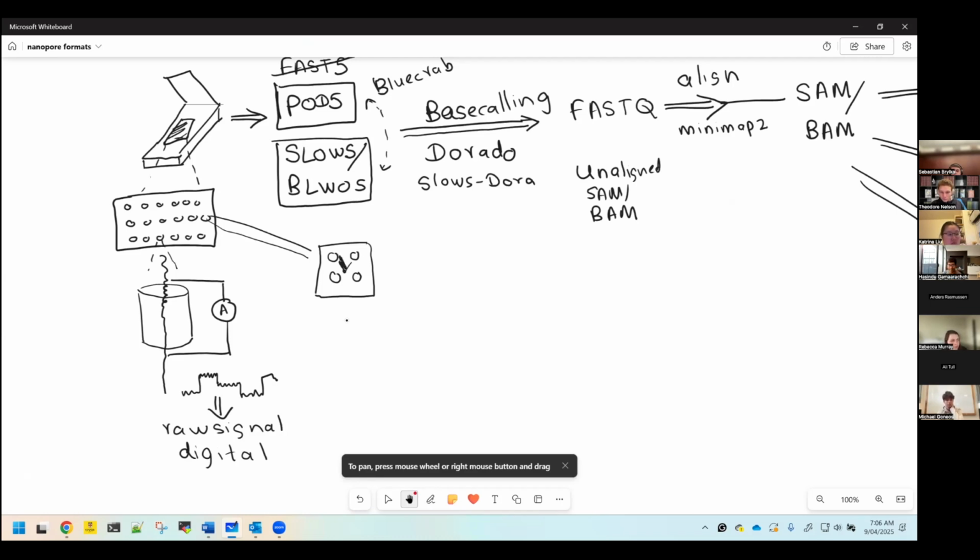If this is mux position 0, 1, 2, 3, let's say, I'm just taking an example, the exact values may vary. If the best mux was set to 0, these reads will contain 0 for that field. But after a few hours, MinKNOW again does a mux scan, because these pores eventually get damaged and die. During the mux scan, it figures that out, and if it is a dead pore, it switches to the next best pore.